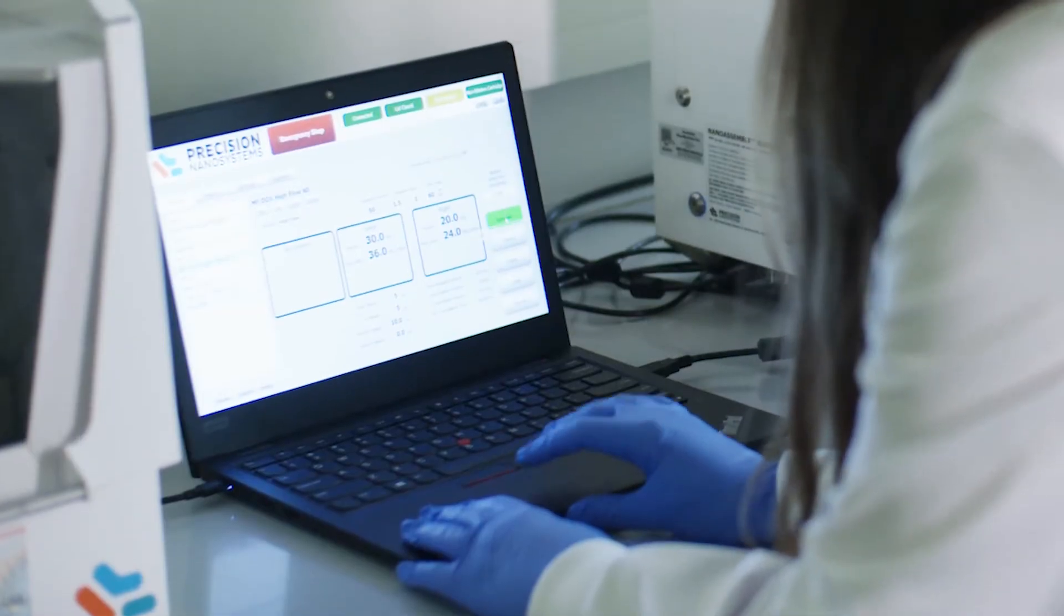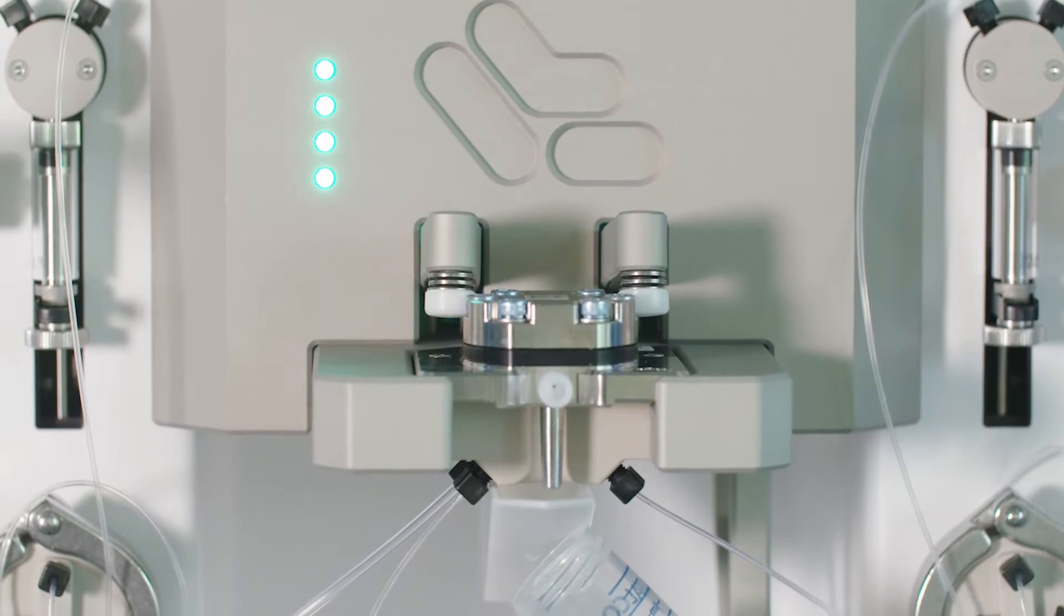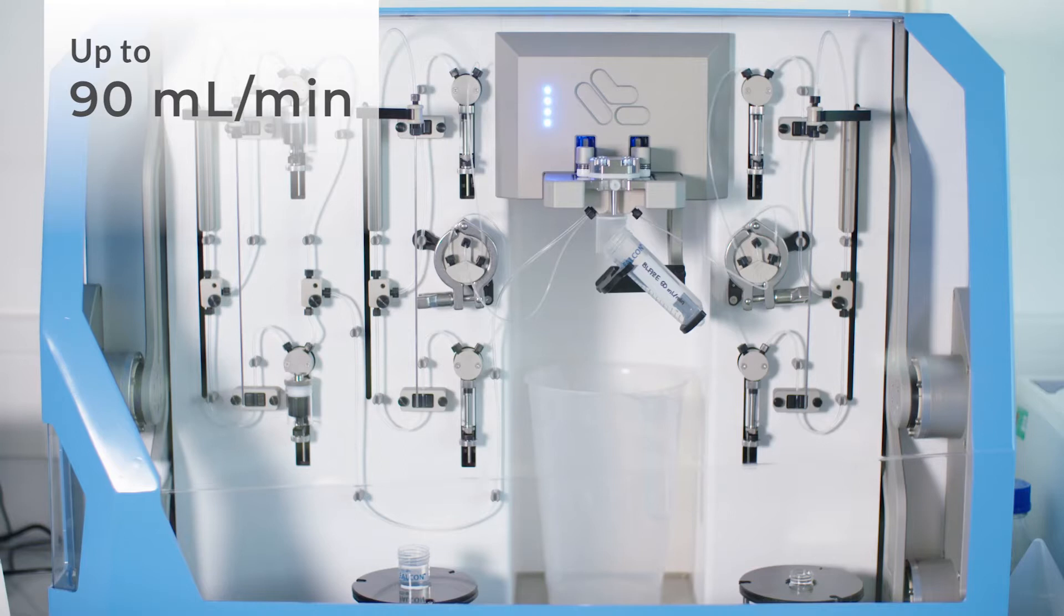An intuitive software interface allows you to easily dial in parameters like total flow rate and flow rate ratio. The Blaze offers the choice of two NextGen mixers and operates up to 90 mL per minute pre-dilution.